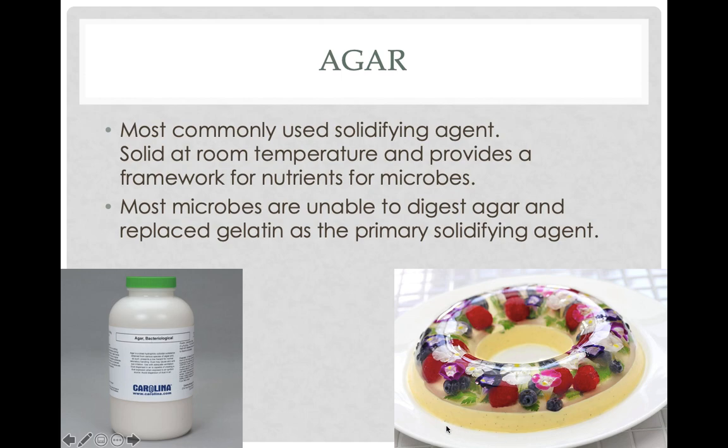It solidifies up, and instead of adding, say, lemon flavoring or that kind of stuff, you add in different types of salts, different types of proteins, different types of chemicals, sugars, and whatnot that different types of bacteria can eat. And the different combinations of sugars or salts will kill certain species, or allow only certain species to grow. You can add in antibiotics, pretty much endless combinations of stuff that you can add in to the Jello to make different types of petri dishes that all do different things.